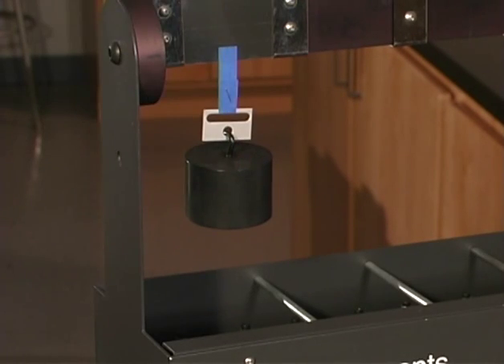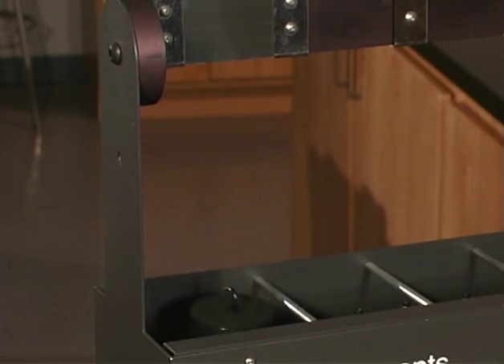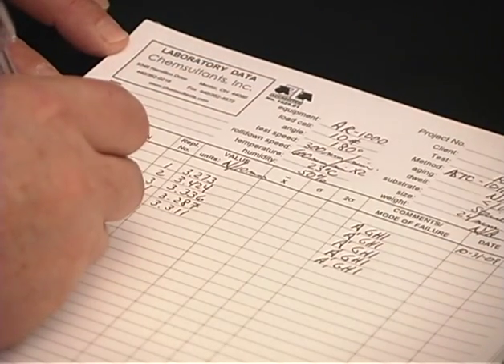Carefully attach the 1000 gram weight so that no impact forces affect the sample. This test is being performed using the 10-bank shear tester from Chem Instruments Incorporated. The design is such that the timer is automatically activated when the weight is lifted from the housing. Upon failure, the weight falls back into the housing and stops the timer.